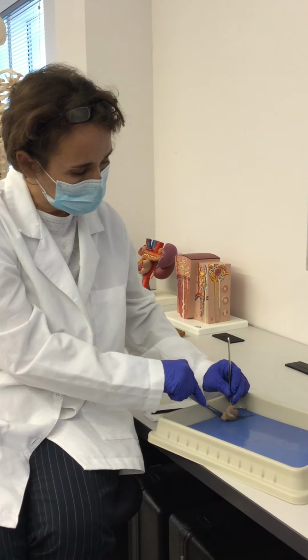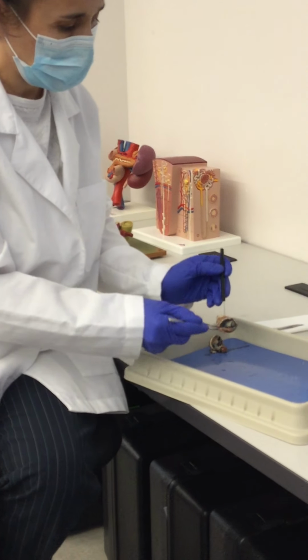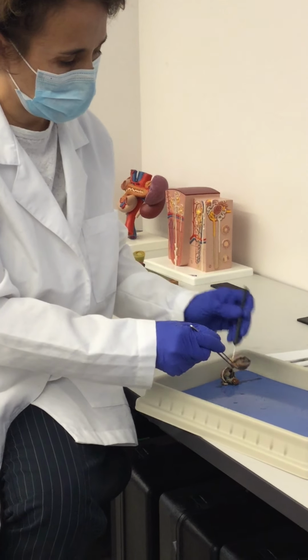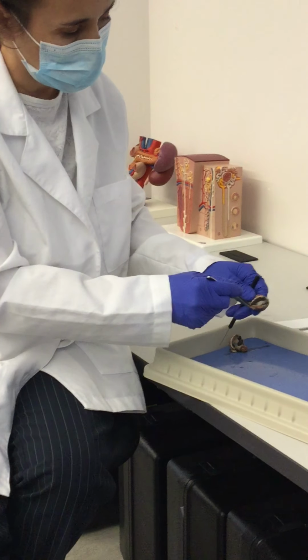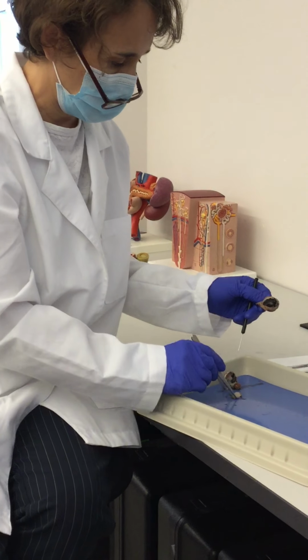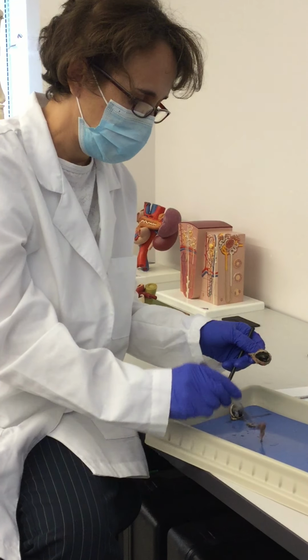Okay, so I did this section. This part that you can see here, I'm supposed to have another set of tweezers, but this part that you see here is part of the lens, the suspensory ligaments that hold the lenses. And this is the lens.